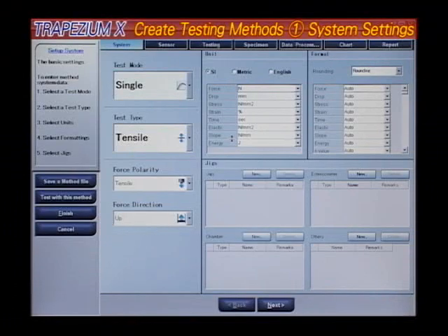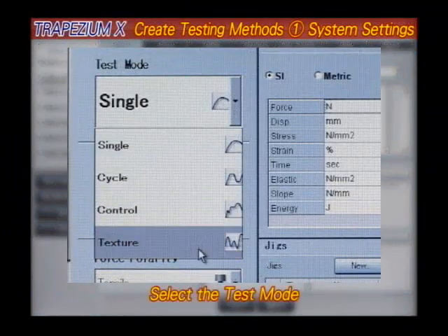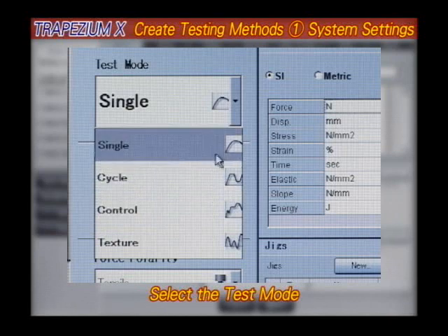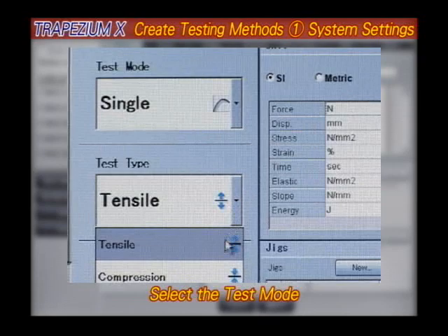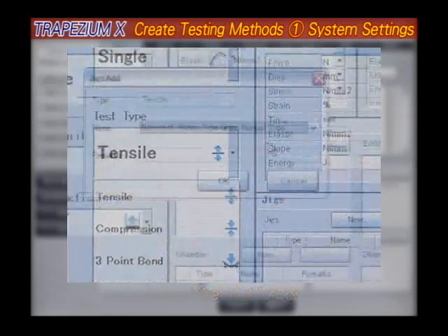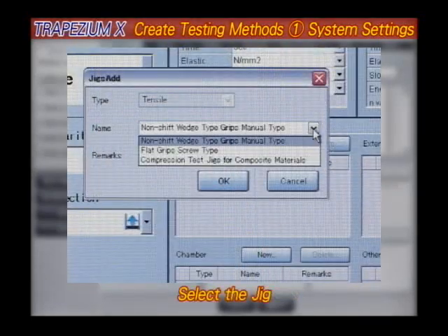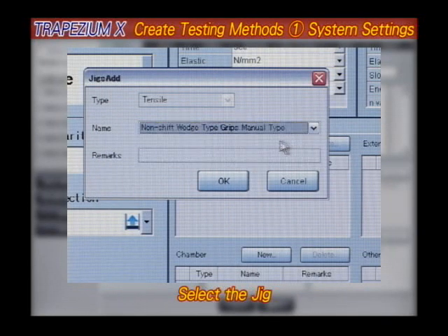Let's start with system settings. These settings include test mode and test type, which are designated as shown here. In addition, JIG information can also be entered via this window, which is then included in the record of test results.